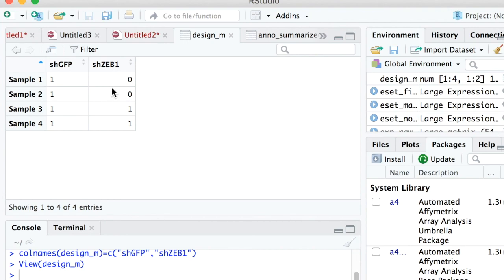And then there are two ones here because these are the two treatment samples. The way to think about this is that sometimes this column is referred to as the intercept, and you can think of it as starting with control, and then based on whether the samples are actual controls or not, we're adding on top of the intercept a value assigned to whether it is a control, zero in this case, versus a treatment, or one.